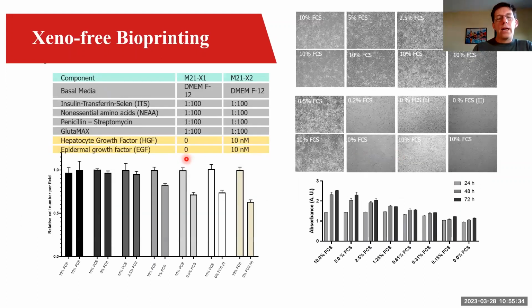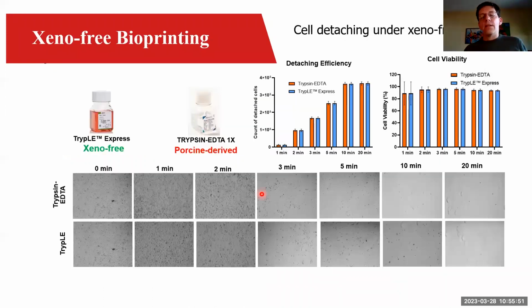And so then my PhD student added several growth factors to the medium, and then he found that they still have a high viability even after a longer period of cultivation. So we had the cells cultured under chemically defined conditions.